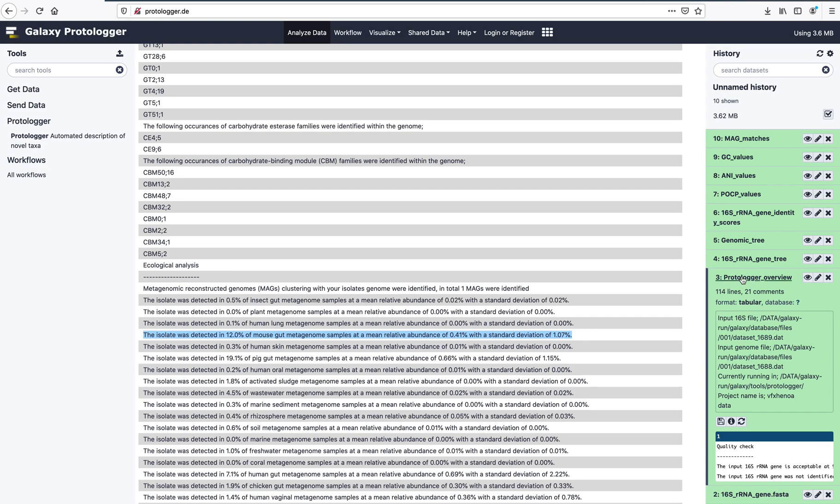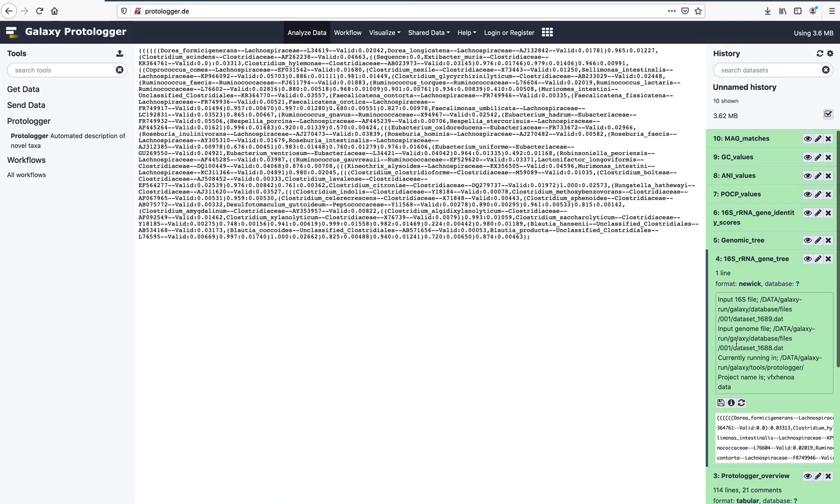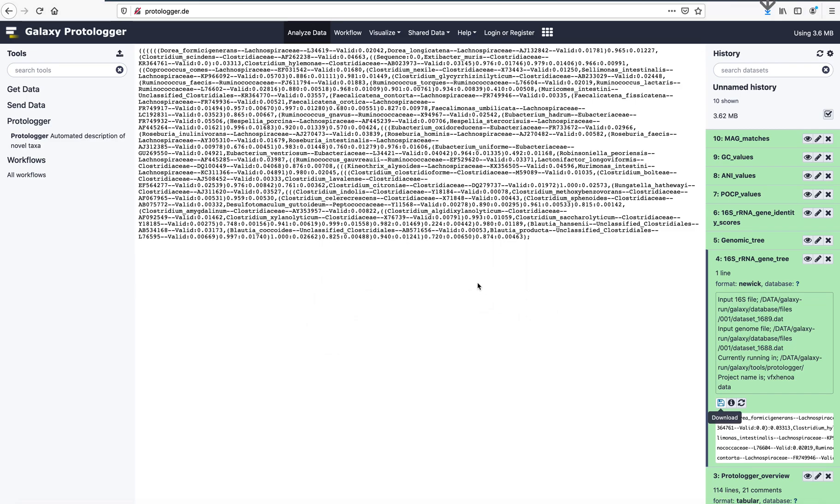The next output is a phylogenetic tree based on the 16S rRNA gene sequences of the input isolate, as well as the closest relatives identified by Protologa. As an unregistered user, the tree cannot be visualized, but can be downloaded to your local machine for further analysis and visualization.